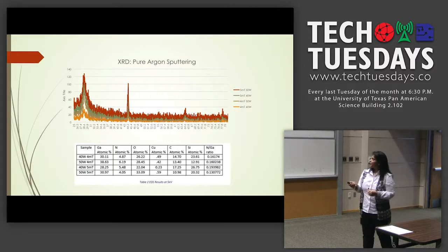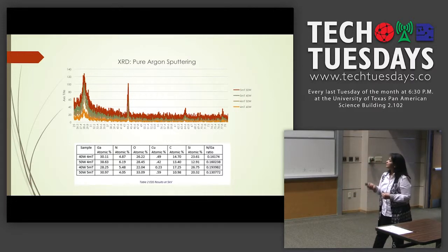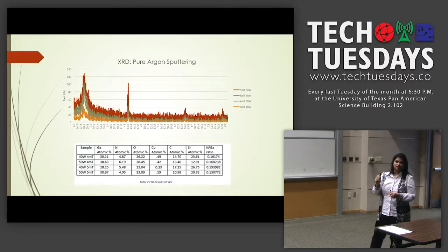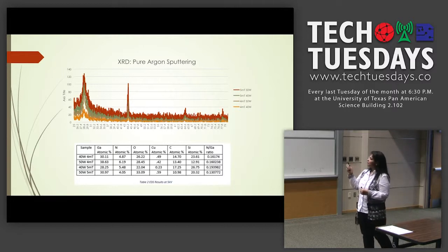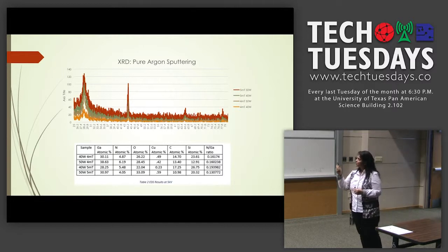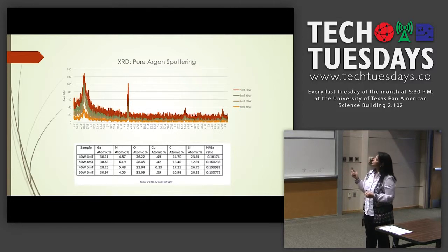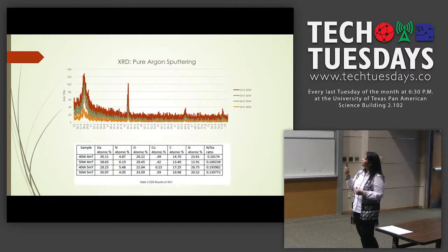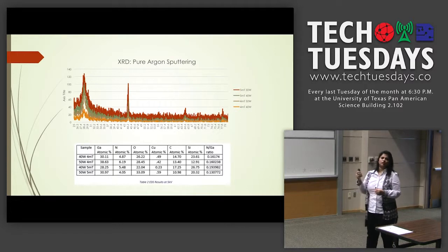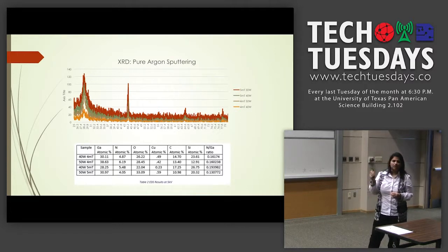For characterization, we did XRD. The peaks show where we are getting the material and whether it's a good or bad deposition. Our main goal is to deposit gallium nitride on silicon substrate, but we observed other materials present in the samples — oxygen, copper, and carbon — so we have to investigate why we are getting these other atoms.